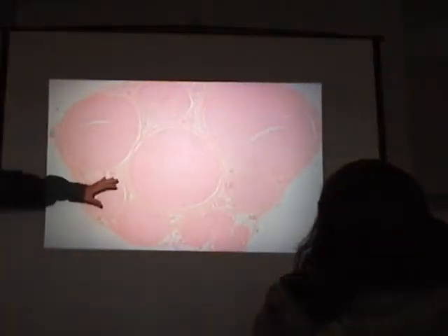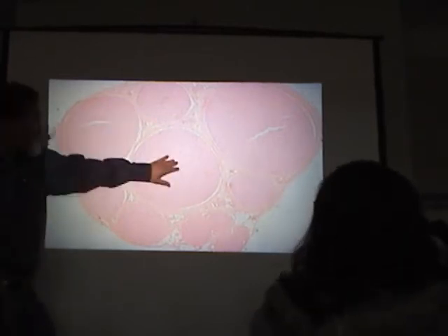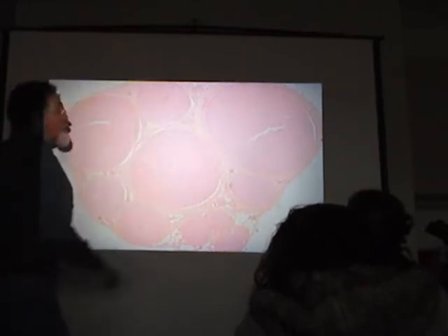Okay, this is a paraffin section of a nerve, and it's quite nice. I don't know, there may be 12 fascicles here, right? Individual fascicles that are held together by what kind of loose connective tissue? We call it epineurium. So this is all epineurium all around here.